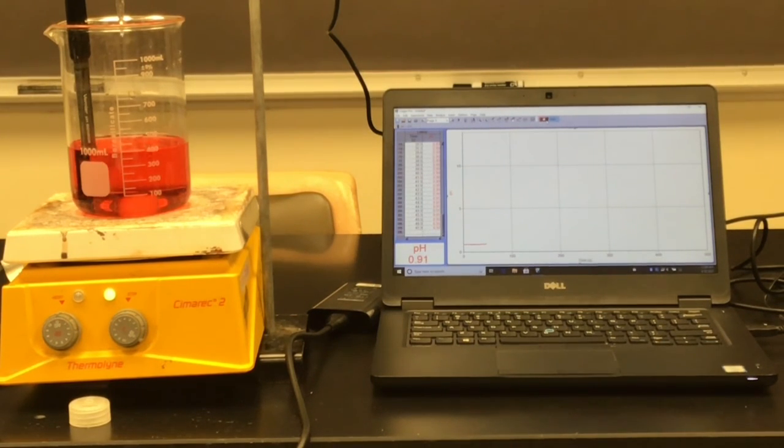Now, please note my graph. My pH really hasn't changed very much. And I'm still red. So here we are, drip, drip, dripping away. And the pH really hasn't changed very much. And now I have added a significant amount. I have added in at this point 12 milliliters of this. And again, barely a change.